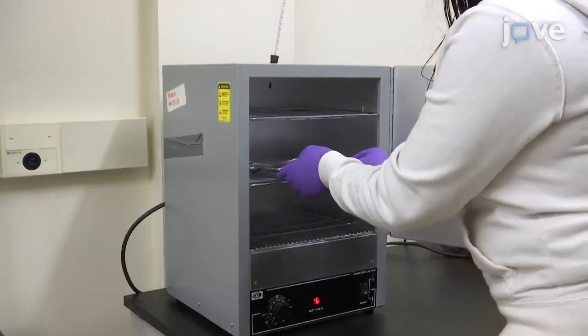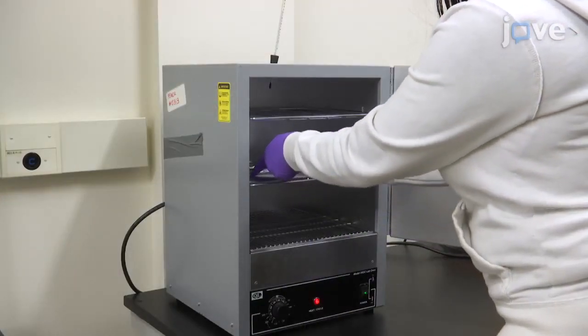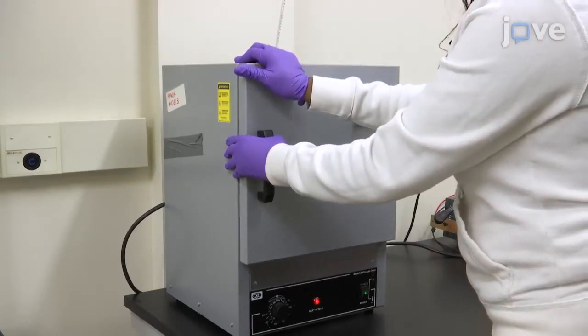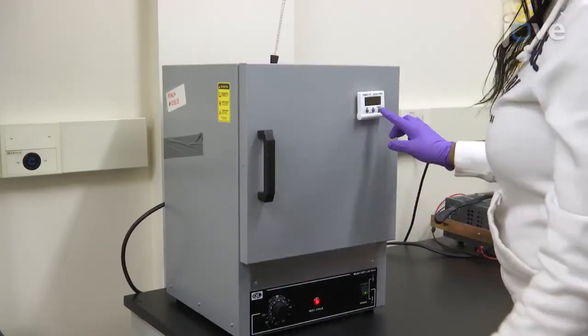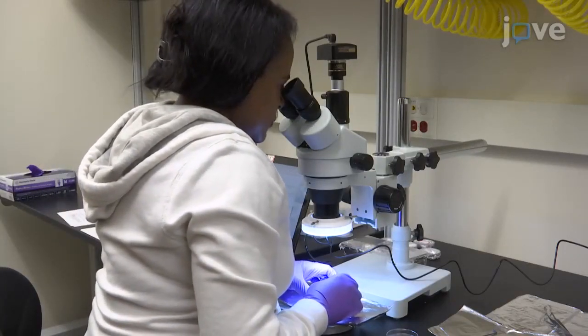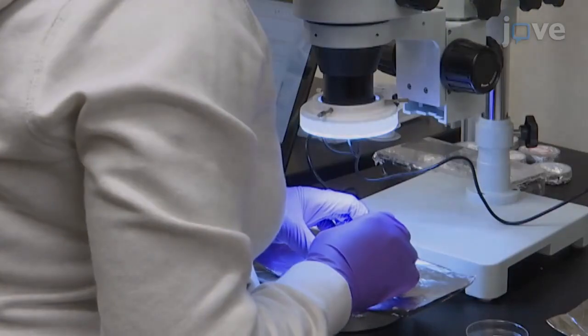Once clean, bake the device components in an oven for 15 to 20 minutes to get rid of any water residue and to degas. Then, using a sharp razor blade, cut the iron tellurium sample to 1 millimeter by 2 millimeters by 0.1 millimeters.